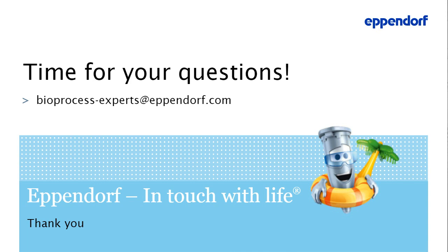Possible solutions would be, of course, to passage your cells earlier before reaching these high densities. Here it's really hard to give a recommendation. Adjust the fill volume to lower, adjust the RPM maybe to slightly higher. A baffled flask could be a solution, and when you have protein expression protocols, they also say it's not impairing the performance. Another option is to just allow clumps to settle and take from the supernatant.